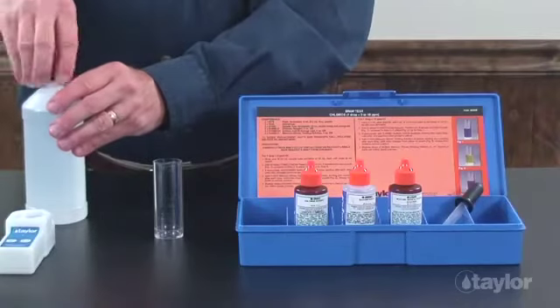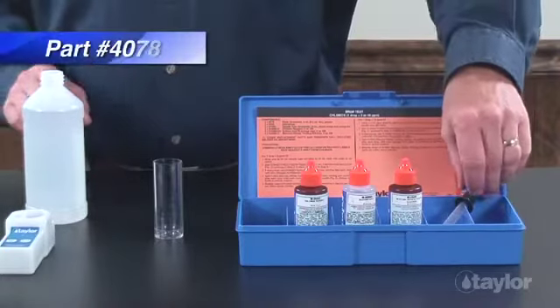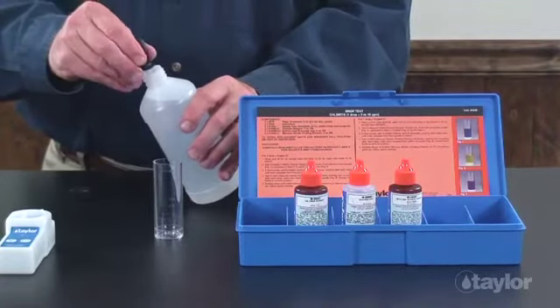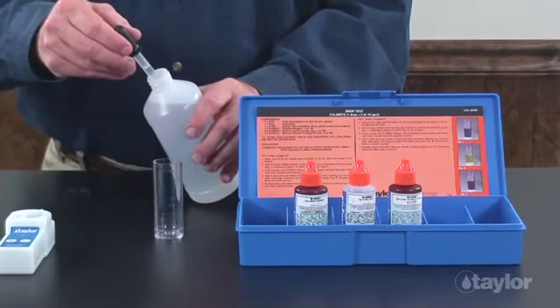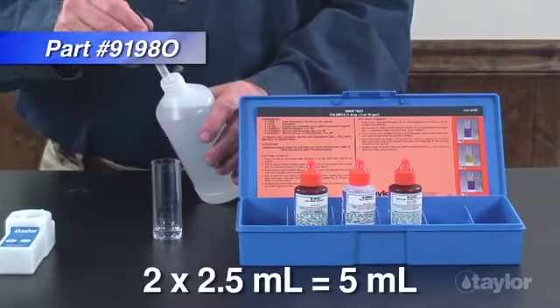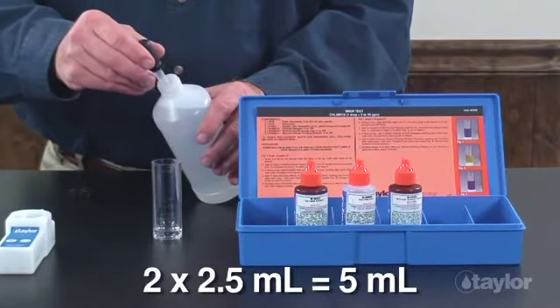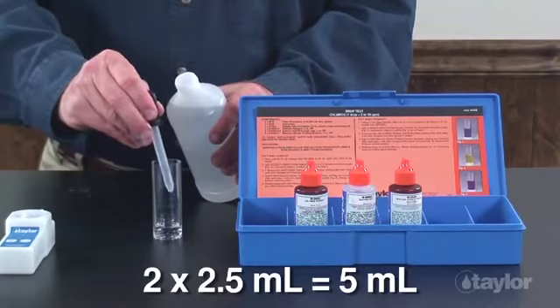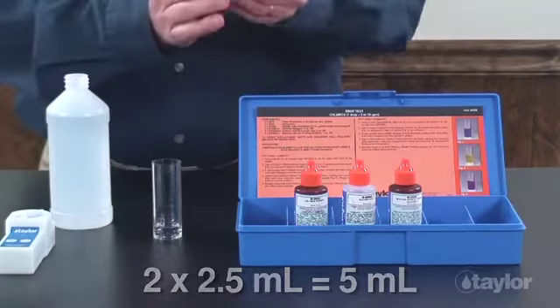First, decide which drop equivalents to use. If you suspect the chloride level is high, fill the 3 ml pipette, part number 4078, to the 2.5 ml mark with the sample water to be tested, and add it to the 25 ml sample tube, part number 91980. Dispense another 2.5 ml of the sample to obtain 5 ml for testing.